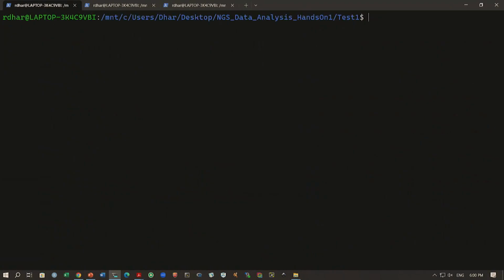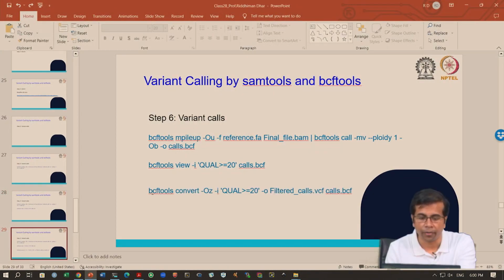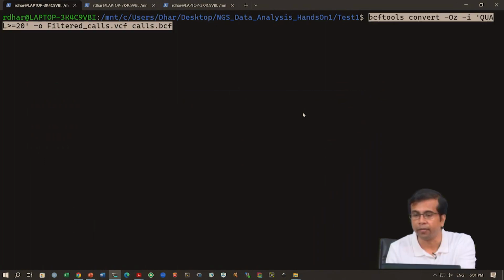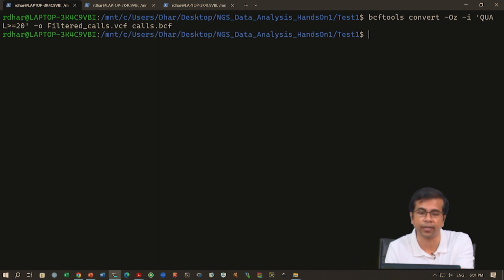So, what we want to do is write this in a file, in this format called VCF, .vcf, and we can then read that file and see what these mutations are, what these variants are, and what type of variants they are, whether they are SNPs or indels, etc.